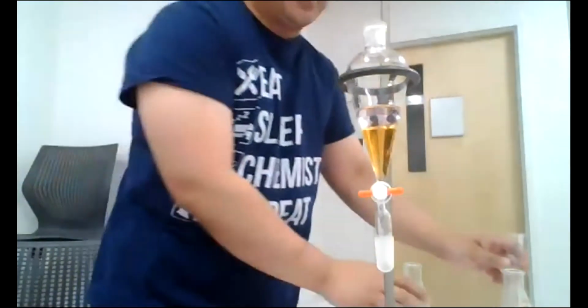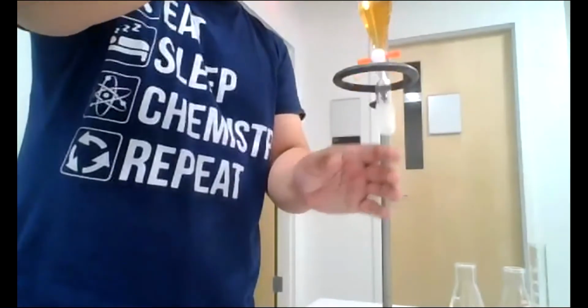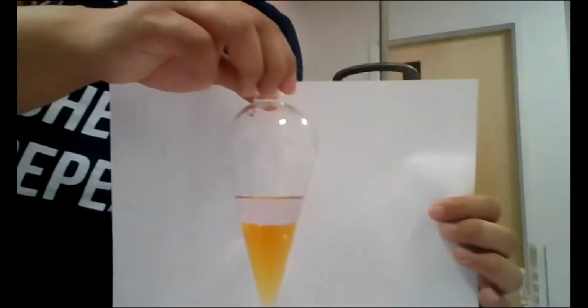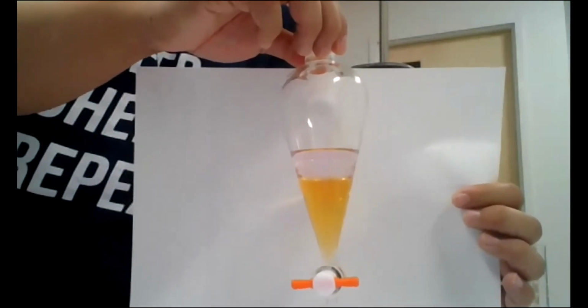Without any shaking and mixing, let me carefully put this a little bit closer. Without any mixing, we have those two layers. Now, I told you that cyclohexane is less dense, so it's the one that's floating. It's the one that is fairly colorless. Make observation notes based on that. Okay, something's a little bit different.